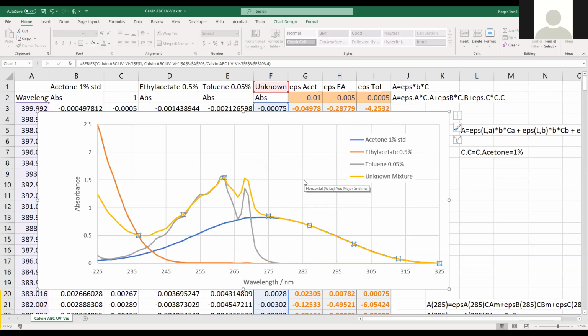Me now? I can hear you. I can hear you, yes. So do you want to use, say, 255, 270, or 285 nanometers? Would it be the two peaks in the middle, the ones that are sharpest? You want to use these two wavelengths. Excellent.